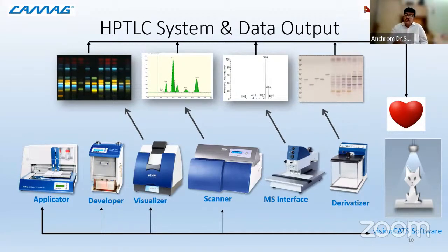Many components are not visibly seen or are at low UV, say 200 nanometers. Now, what is the concept of low UV? It is like my components are being separated on the plate, but I'm not able to see them either visibly or in the UV, as they are not being detected. So how do you understand whether it is there or not? So I do a simple step.